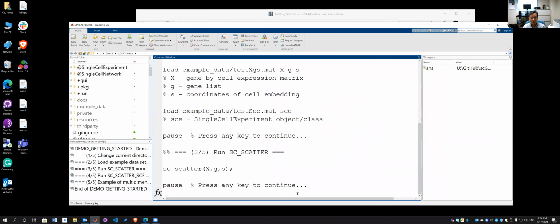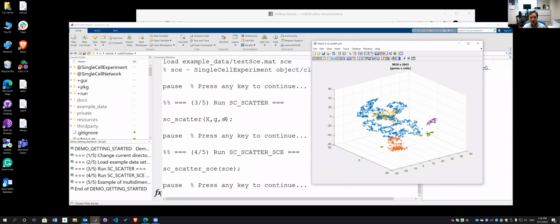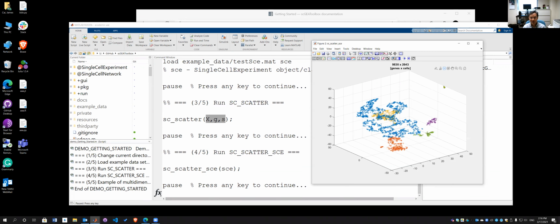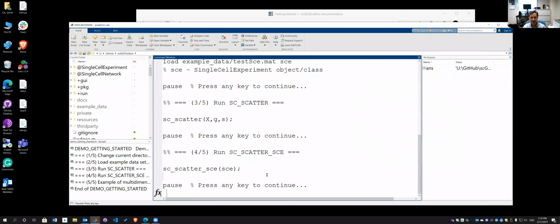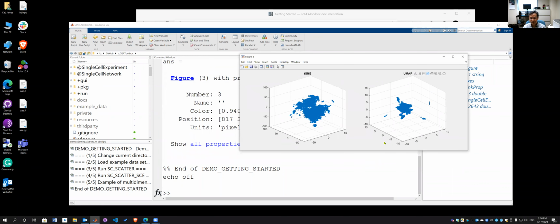So the last step in this demonstration is to load not only this, but another object. So this object is a composed variable, which includes all of this information and also something extra. That's why you can give the color and the separation of clusters. Okay, and then I think that's the last step. This shows you another function which is inside the tools.